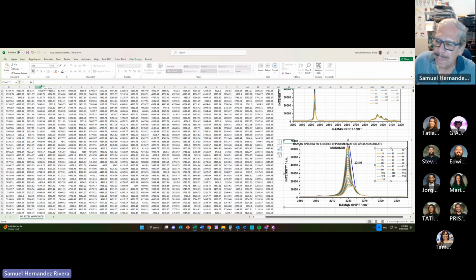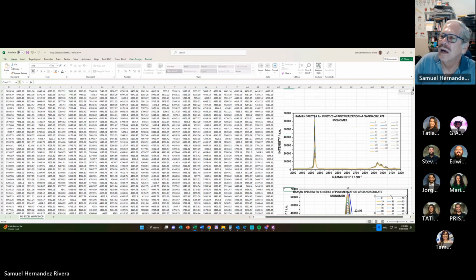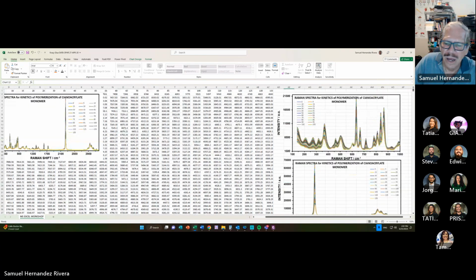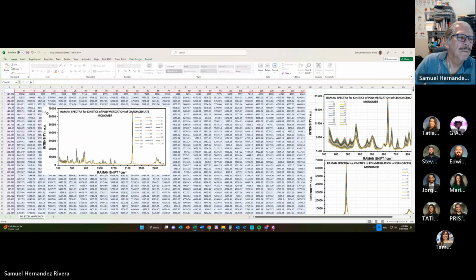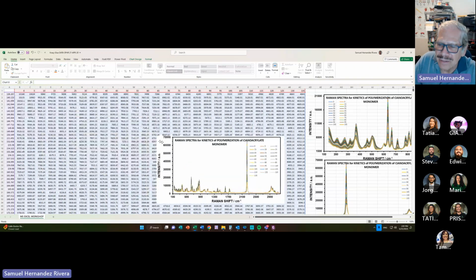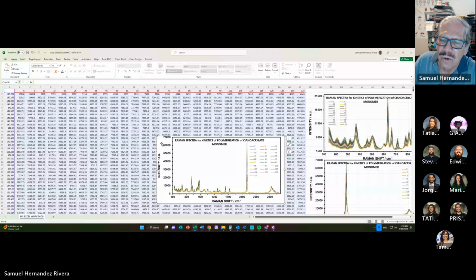First of all, what does Raman shift represent? And why is it going from 0 to 3,400? Anyone? It represents the Raman-Stokes shift. Okay, it represents the Raman shift. Okay, so what else does it represent?